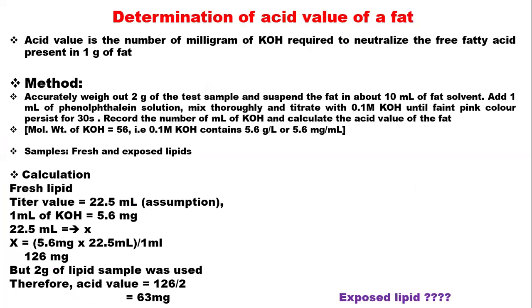The last stage of this experiment is determination of acid value of a fat. Let's first define what acid value is. We say it is the milligrams of potassium hydroxide that is required to neutralize free fatty acid that is present in 1 gram of fat.